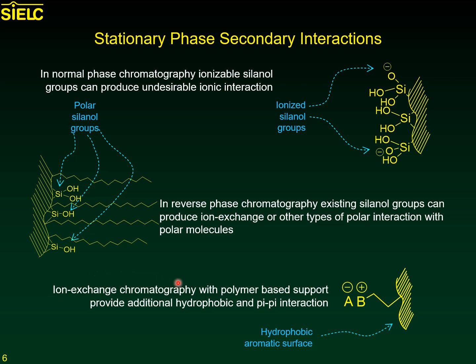And with ion exchange chromatography, the polymer-based support of your ion exchange stationary phase can actually introduce hydrophobic or pi-pi interactions, similar to that of a reverse phase column.